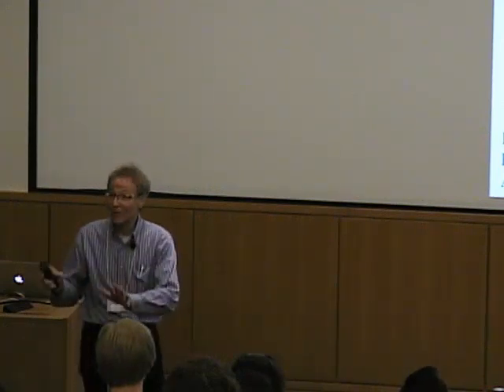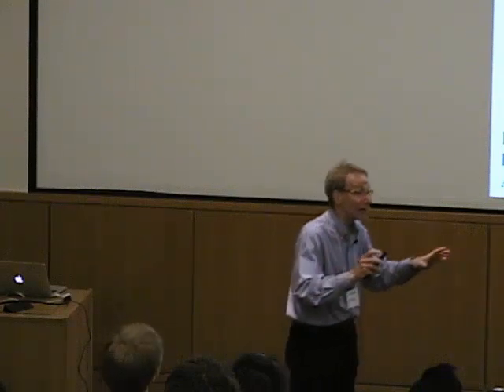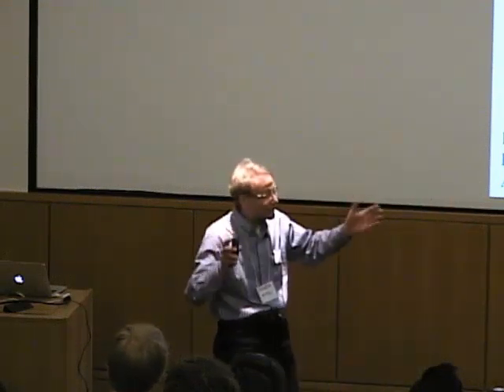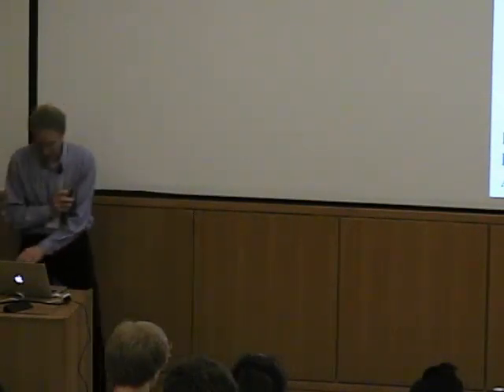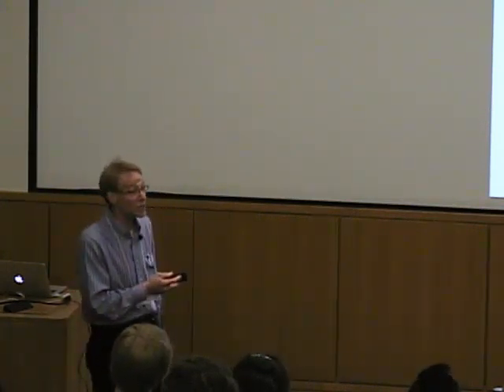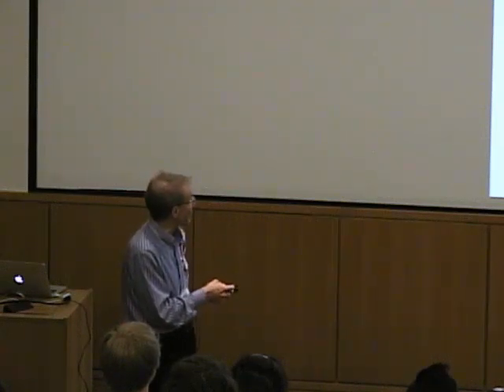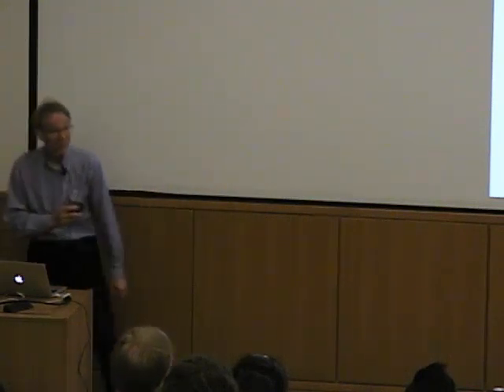Okay, so hopefully you can see there's a number of problems with this analysis now because they're using the experimental enthalpy, and this is kind of a backdoor way to get at things. So we figured there must be a more straightforward way to quantify this. In fact, by looking carefully, we've actually found conditions under which we can do a more standard metal binding experiment, copper into albumin in different buffers, and notice that that's a weaker binding, but that's well within the C window.